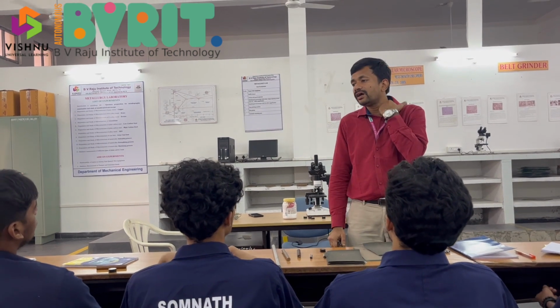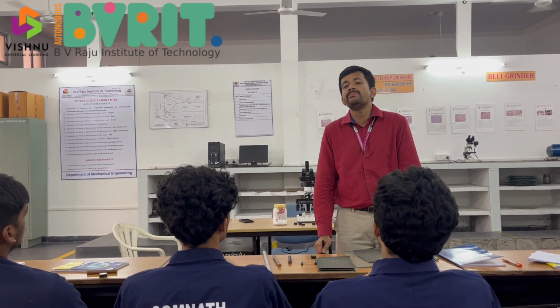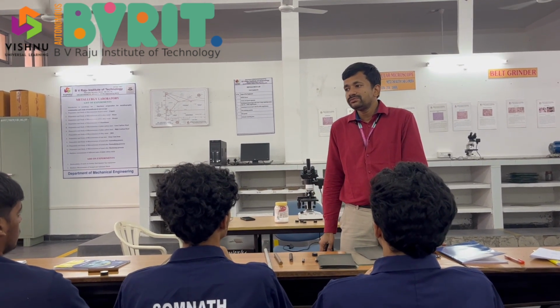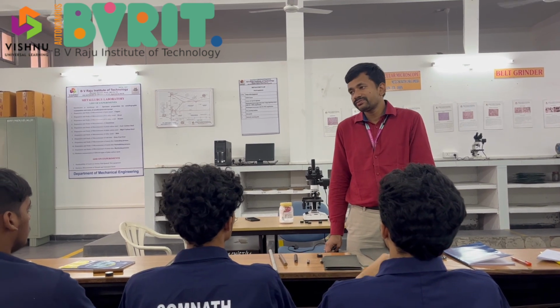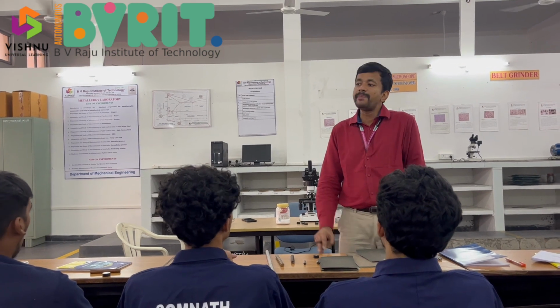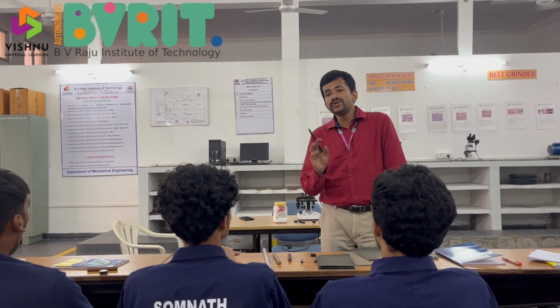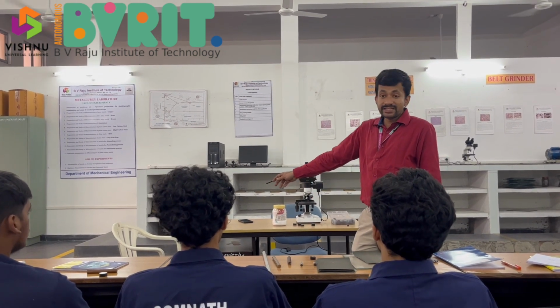The main important things to remember, the do's and don'ts in this lab, are, first, apron and shoes. In any lab you go to, these things are mandatory. Apart from that, careful usage of the microscope and etchants.